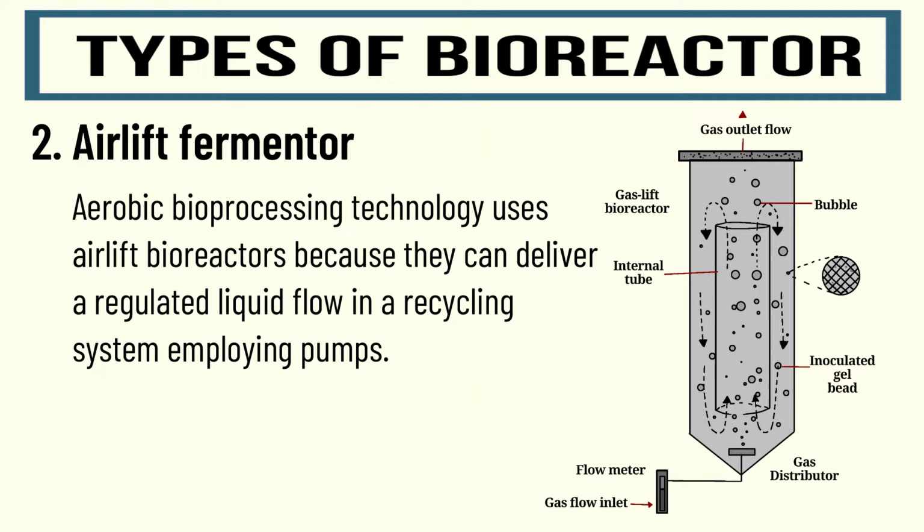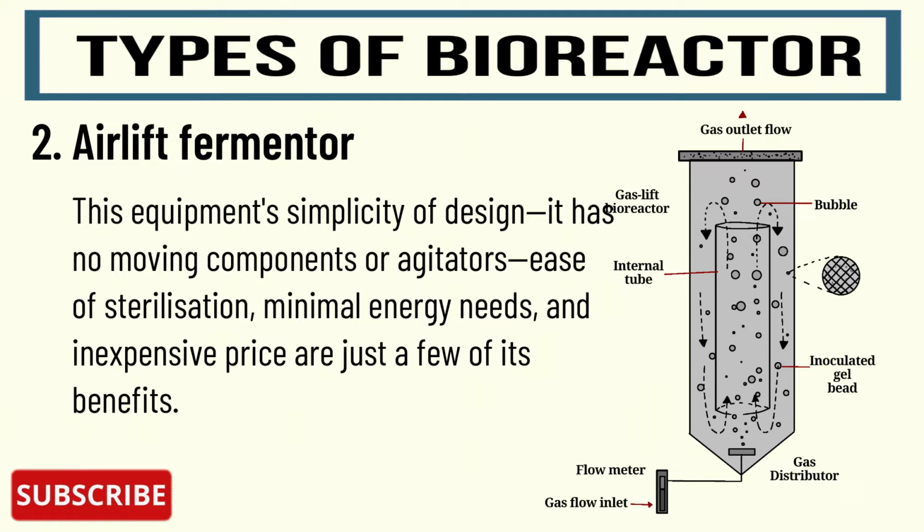Aerobic bioprocessing technology uses airlift bioreactors because they can deliver a regulated liquid flow in a recycling system employing pumps. This equipment's benefits include simplicity of design with no moving components or agitators, ease of sterilization, minimal energy needs, and inexpensive price.